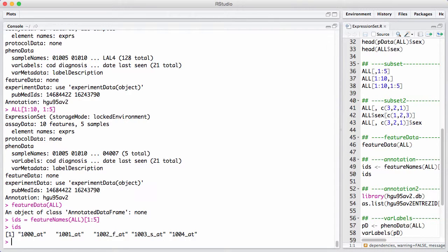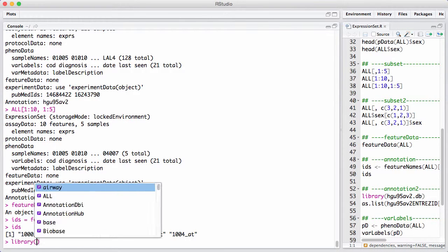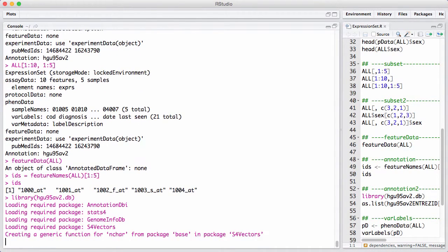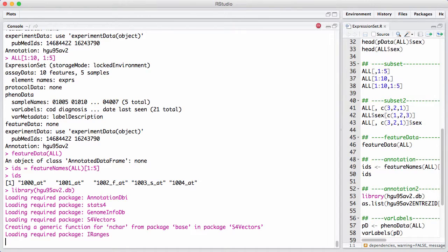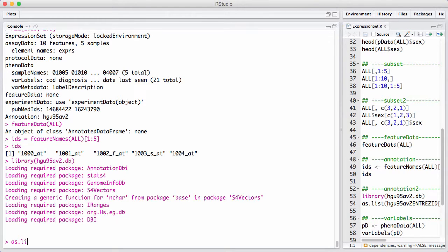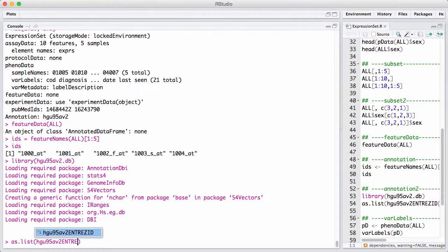In Bioconductor, this is done through an annotation package. And in this case, because the microarray was of a type called hgu95av2, which is a very widely used, or was a very widely used microarray, this information is inside the hgu95av2.db package. We're not really going to go into details about how to use these packages, but we'll just point out that it's possible using various maps inside of this package to map these Affymetrix IDs into specific things. So, for example, there's an object that allows you to map into Entrez ID.